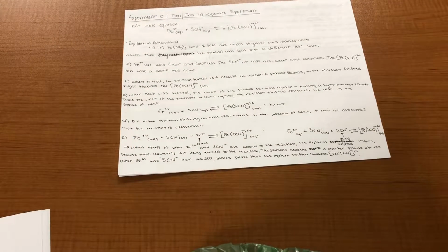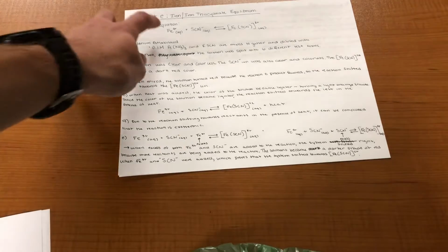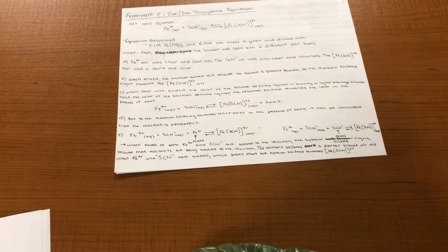The next experiment being explained is experiment E, which dealt with the iron and iron thiocyanate equilibrium. The net ionic equation for this equilibrium is shown here. Equilibrium was established by mixing 0.1 molar of iron 3 nitrate and potassium thiocyanate and diluting it with water. Then the solution was split into 6 different test tubes.